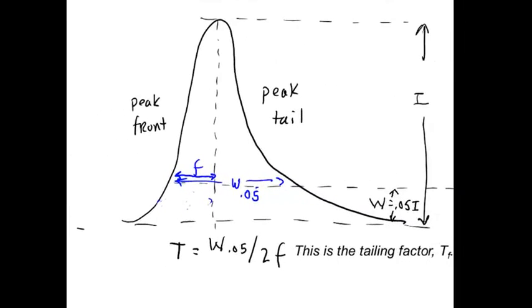The other way that I've seen a lot of people do it is to use something called the tailing factor, which is really particularly specific to tailing. You take the whole width of the peak, now at 5% of the peak max, and you divide that by twice the sort of trailing width. So these are just two examples.